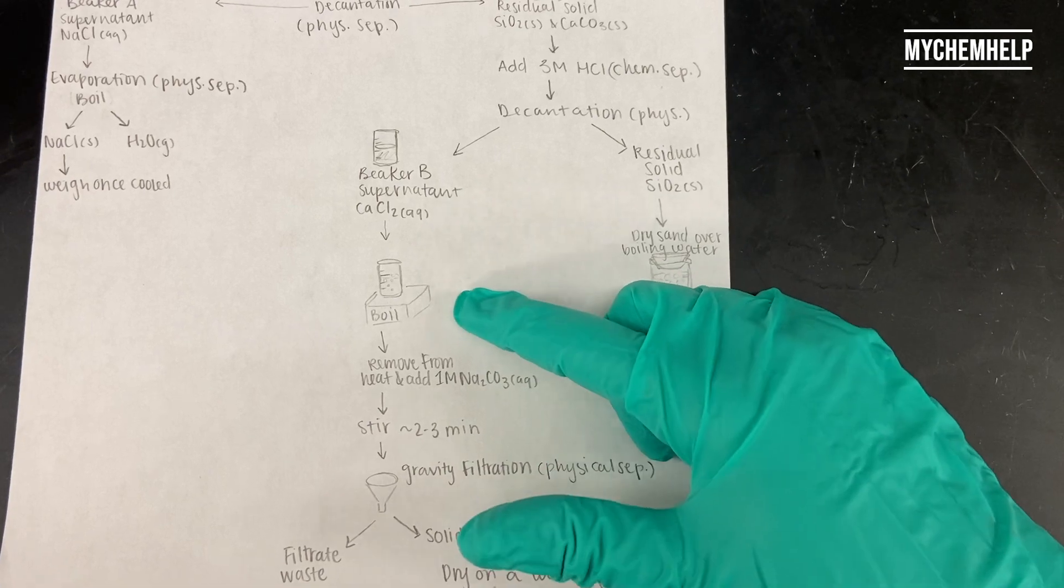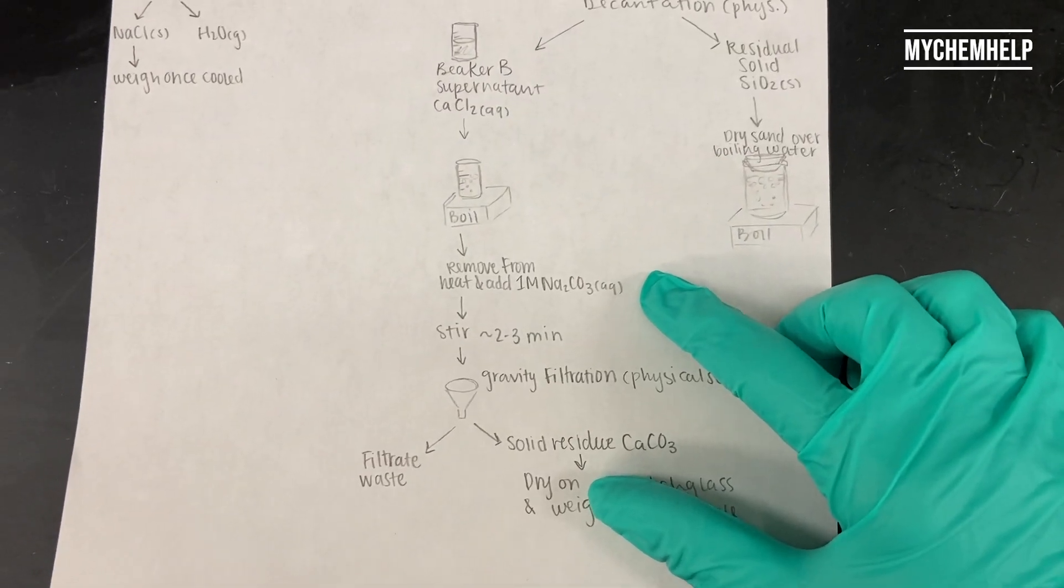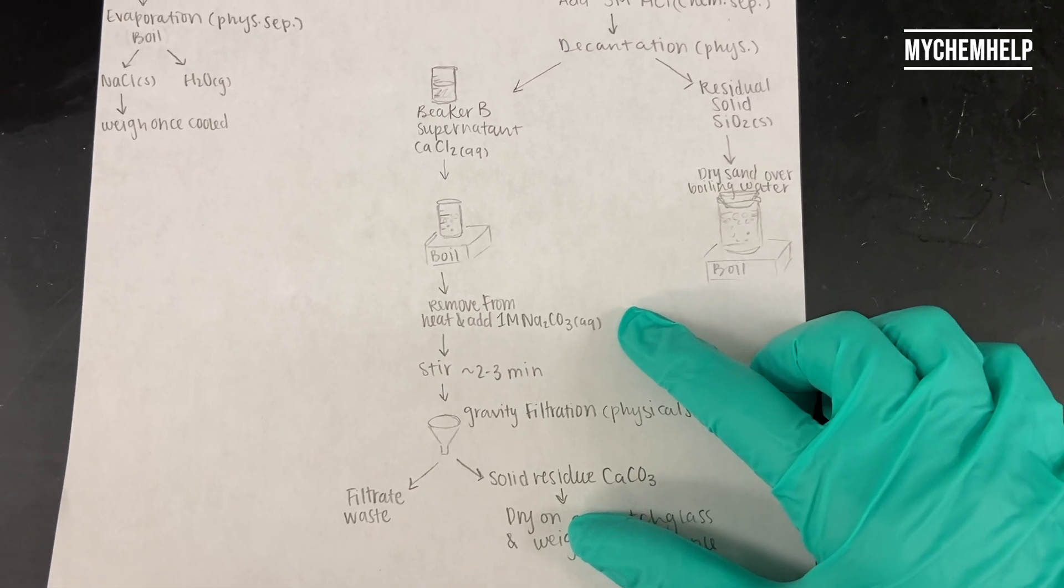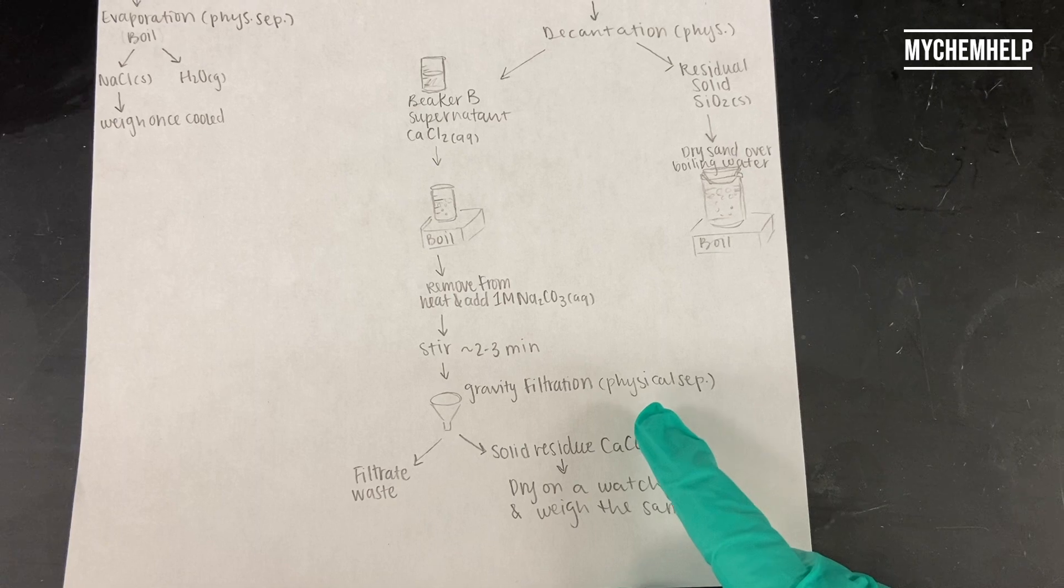And then back to beaker B, we're going to get that up to boiling, remove that from heat, and add one molar sodium carbonate. Stir for about two to three minutes, do a gravity filtration.